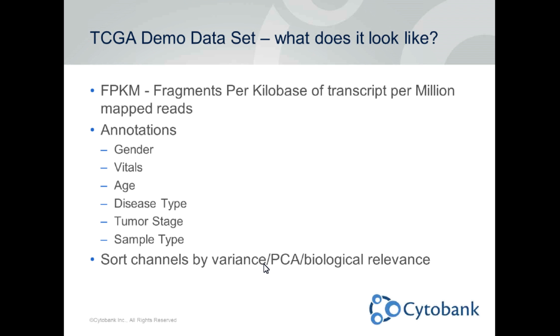And they might not change the most. It's totally okay to tack those on based on your biological question. So if you have a gene or protein or clinical outcome that isn't highly variable but is still very interesting, by all means, include that in the data set. It just has to come in under 816 total channels.